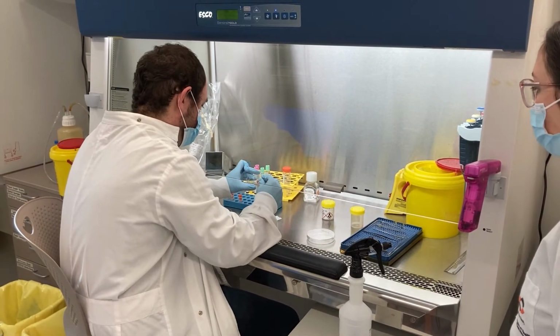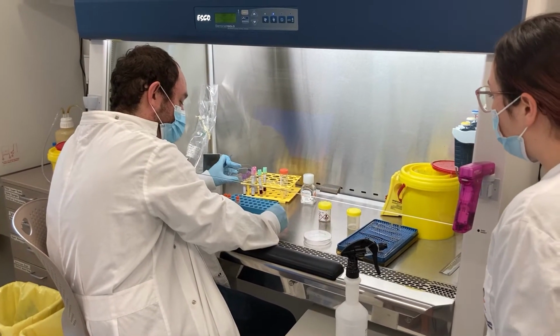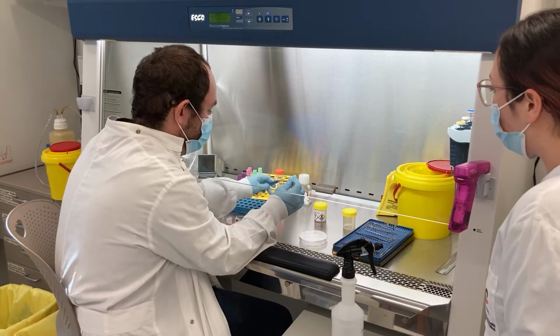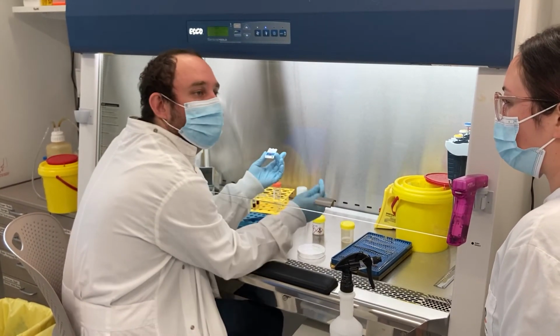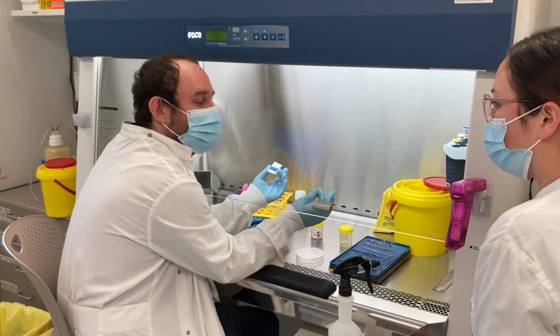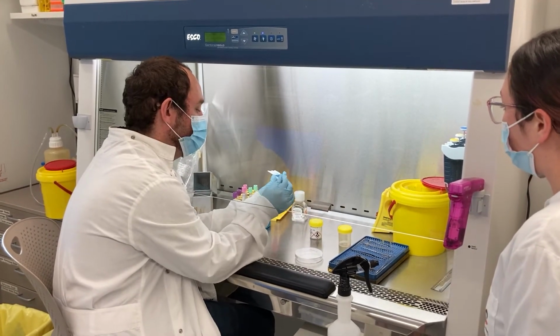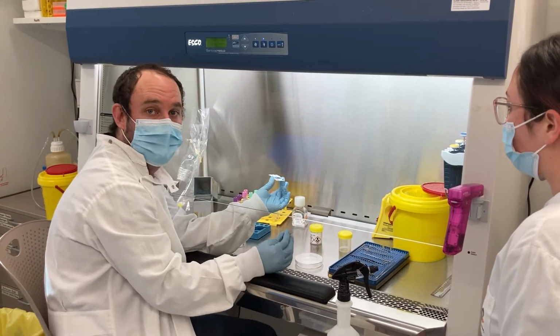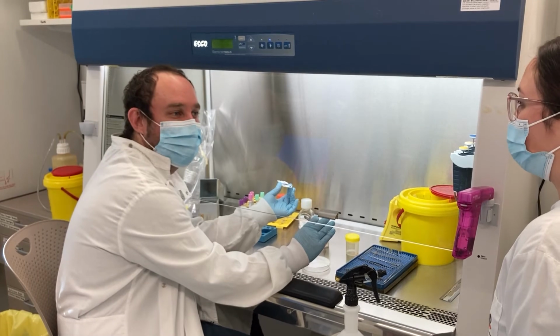Is that the one where you slice it up? Yep. Paraffin, actually. Paraffin one. So that's all we need, because we're building out one. You guys do tissue slicing? Yep. So we take deli slices of the patient's tumour. So we'll embed this in a nice medium that's very solid, and we'll actually deli slice it, very similar to Woolies when you're getting a bit of ham.